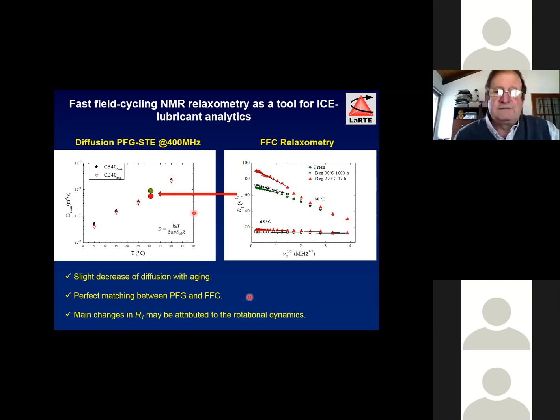And the second point I want to stress here is that the diffusion after this degradation is practically not changing, just a minimum change. So the strong change observed here in the relaxation rate dispersion is mainly due to the rotational dynamics. The changes are mainly affecting the rotational dynamics for this kind of degradation.